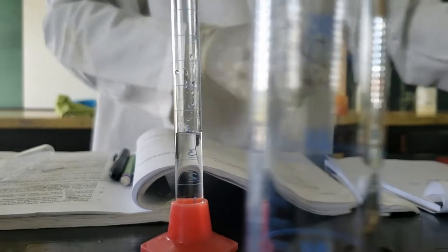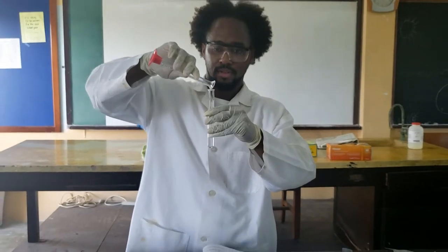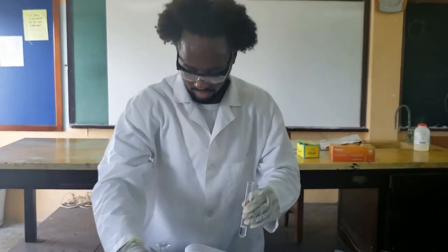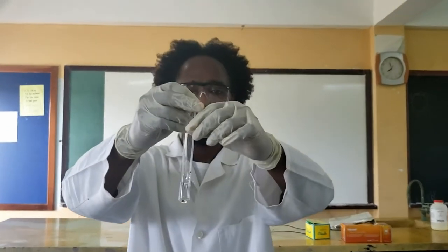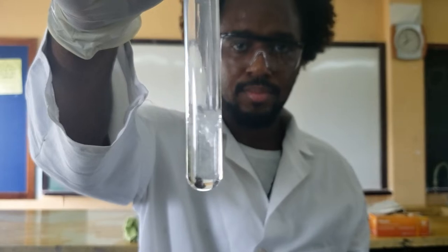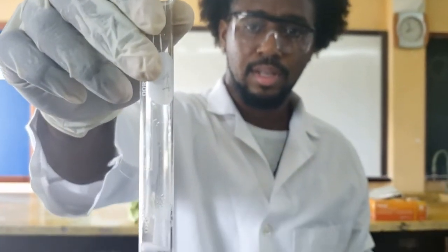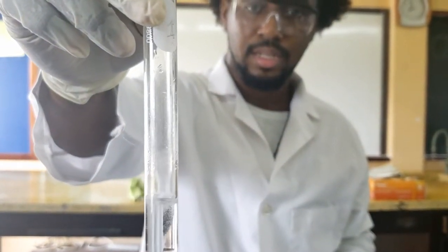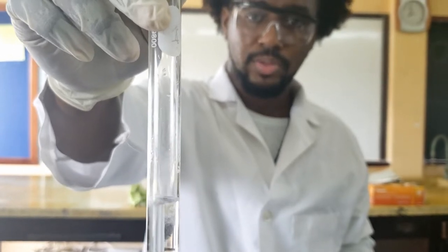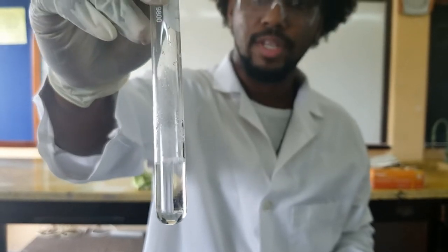We have four mLs of the acid — add that to our test tube. Zoom in here and see what happens when we add the metal. Notice there is a smoke coming off as that metal produces some effervescence, and eventually it dissolves.